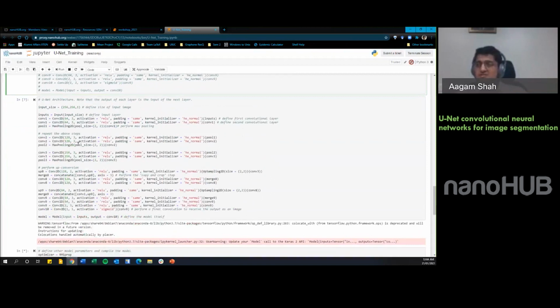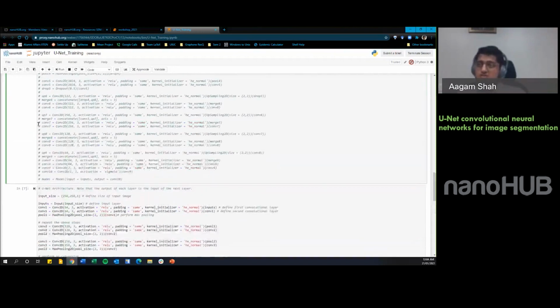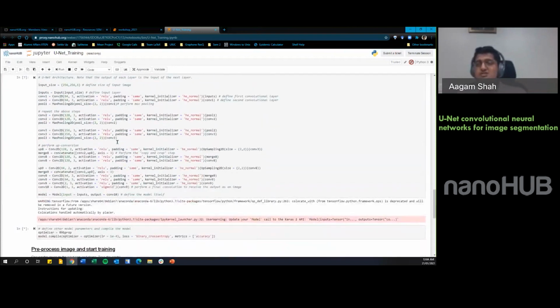And here is a much smaller version of that. I have quickly removed a few such bunches of units from the middle so that we save on some of the computational time. But that's really not required if you have more than 1 hour.